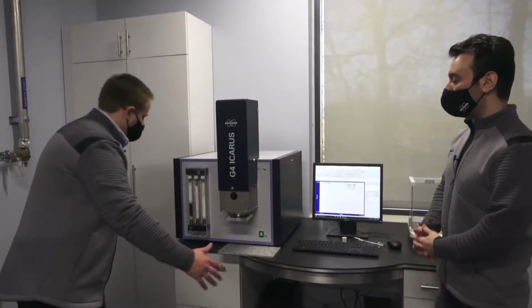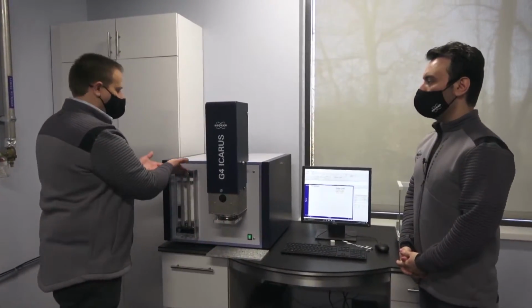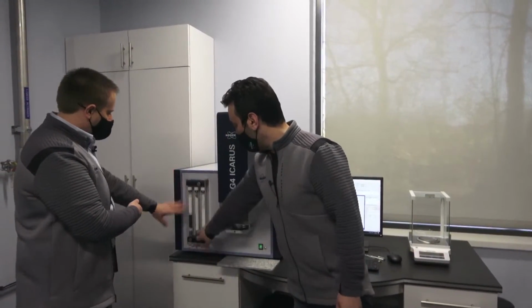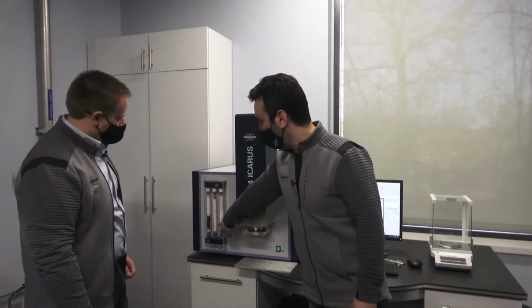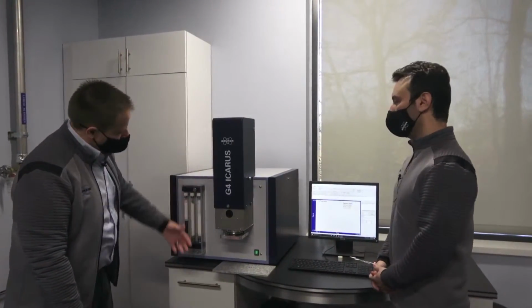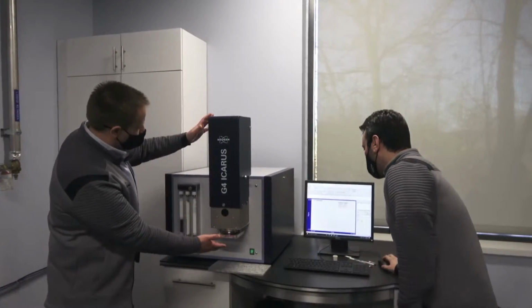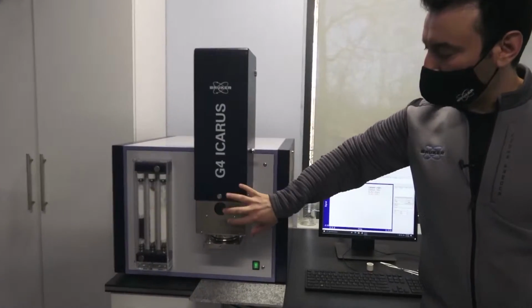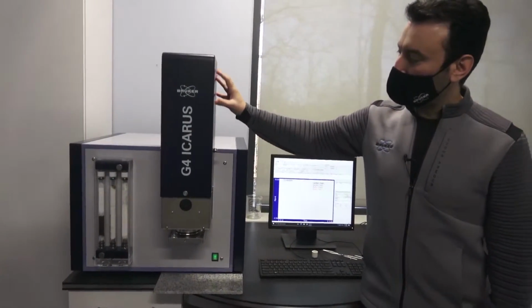Okay. So basically that's the intake. That's where the air from the room is coming in. Yeah, actually, this is for pre-cleaning of the carrier gas. Okay, carrier gas. And yeah, this is for the moisture removal from the sample. Okay, so those are the kind of the inputs, and that's going to come here. This looks like the business end. Exactly. This is the furnace. Okay. In here, we have the furnace, and above this, inside this box, we have the auto cleaner.